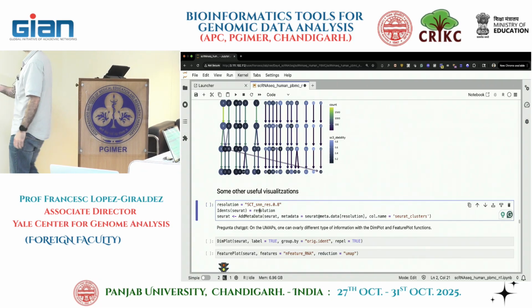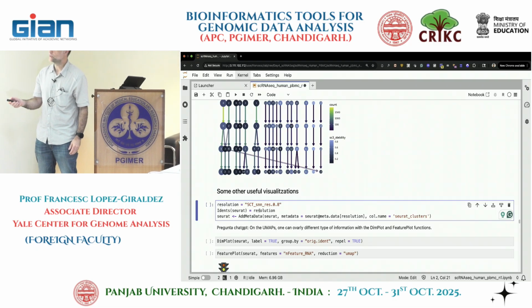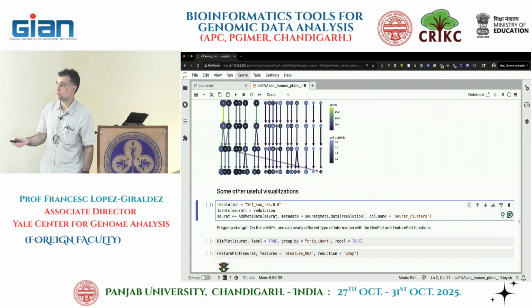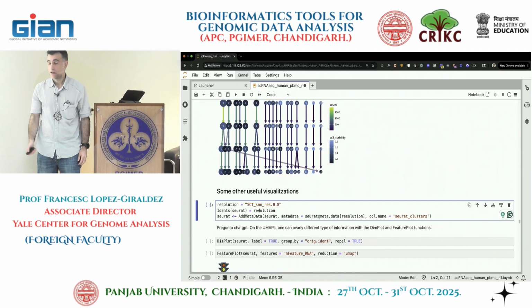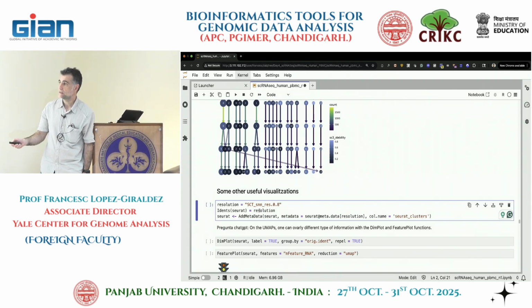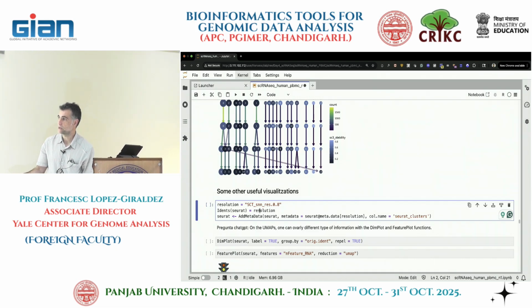So if we want to change the column called Seurat clusters, we can do that too. I'm saying use this column here in the metadata, which is going to be called Seurat cluster, added to the metadata. That's what we're doing. We may have a way to create other types of identities, and we can add another column to the metadata using add metadata to the Seurat object.